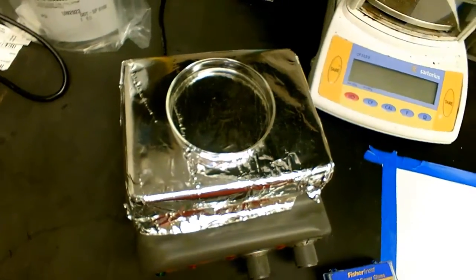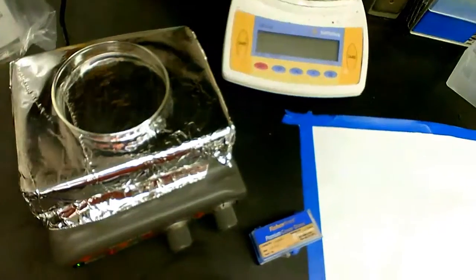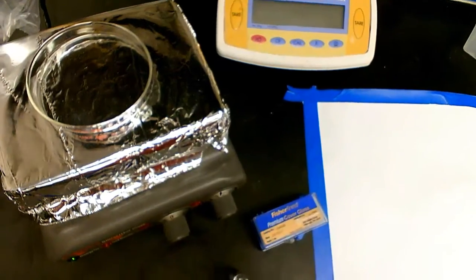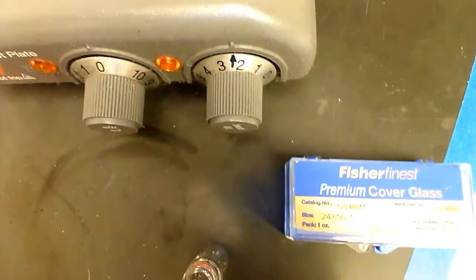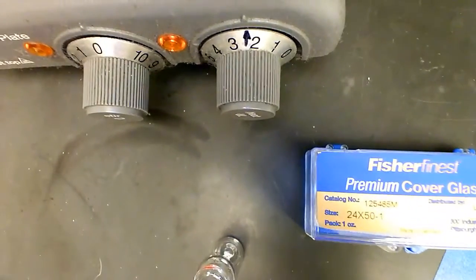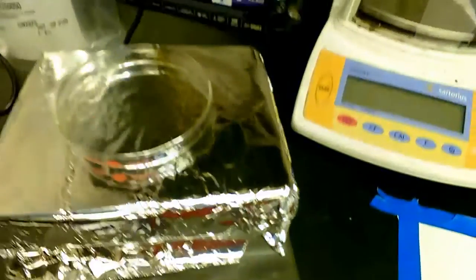Alright, so now I'm gonna show you how to drop cast a polymer thin film. So you're gonna first turn on your hot plate, right? Make sure that the hot plate is not too hot. So you guys can see over here we're having an arrow. So make sure you set the hot plate to that arrow. This has been shown to be sufficiently hot to make a good polymer thin film, right?